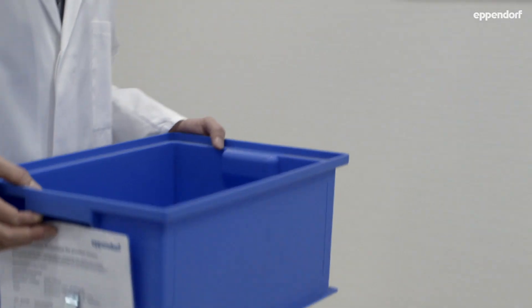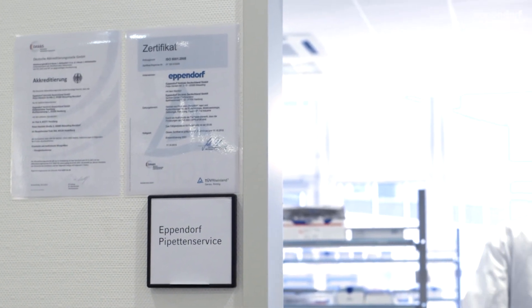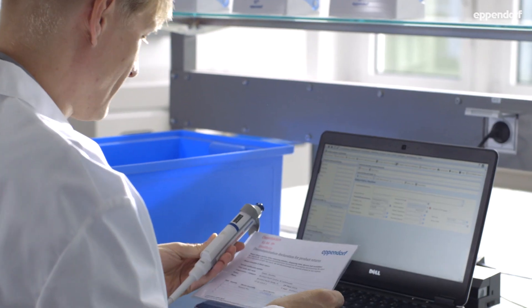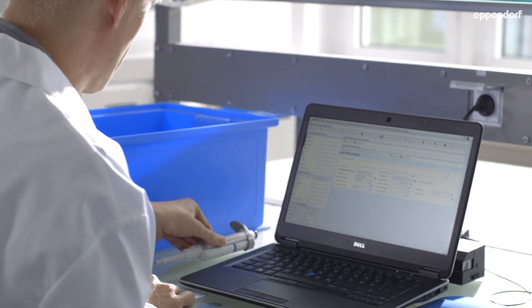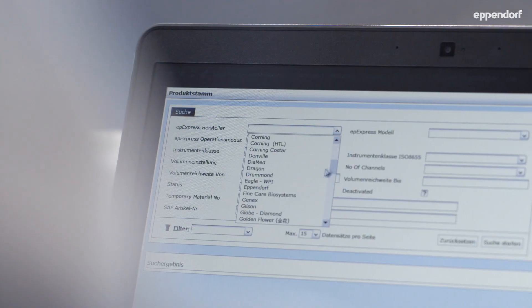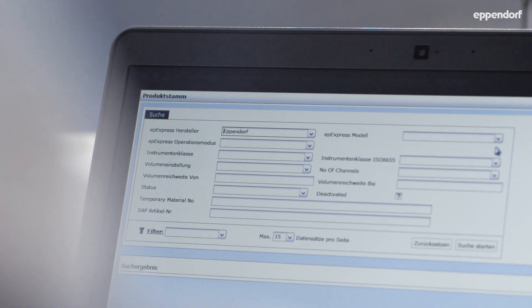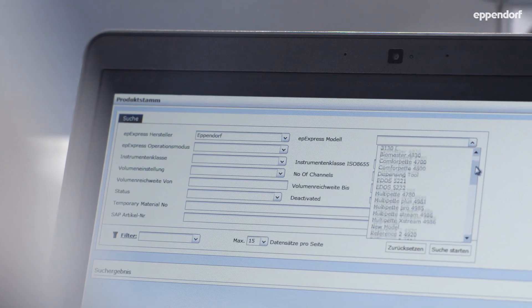In selected markets, our services are accredited by ISO 17025. Pipette and order details are entered for tracking this service and for monitoring the performance history of your pipette.